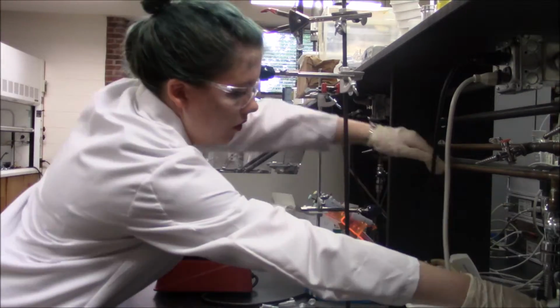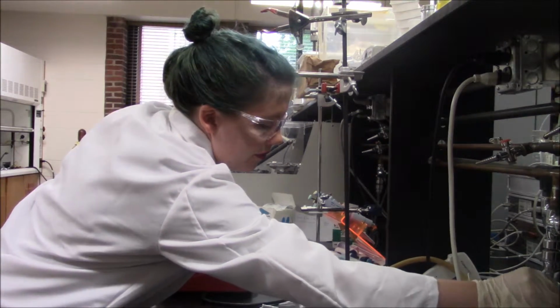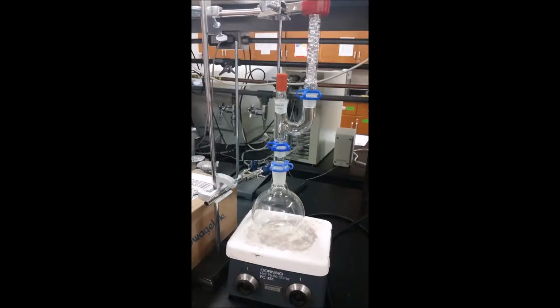Assemble the distillation kit as so, and remember to attach the segments together with the blue clips. Make sure to attach the tubing to the water-jacketed column and turn the water on so that the column is full.